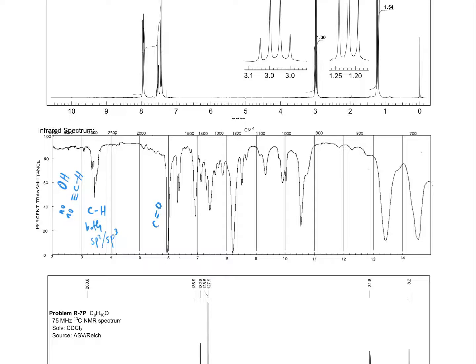Okay, and I would stop here. Look for OH, look for carbonyls, and get a sense of what type of carbon hydrogen bonds you have.